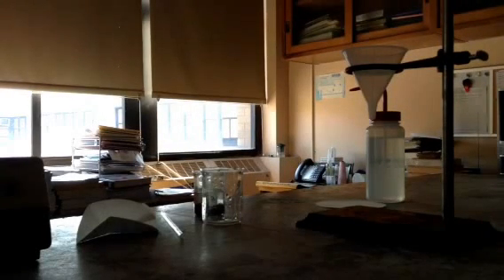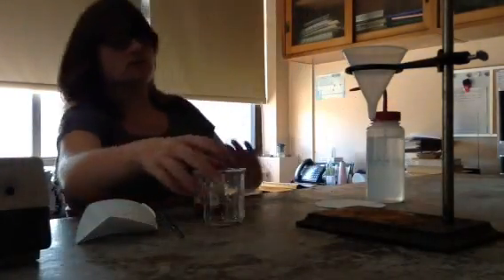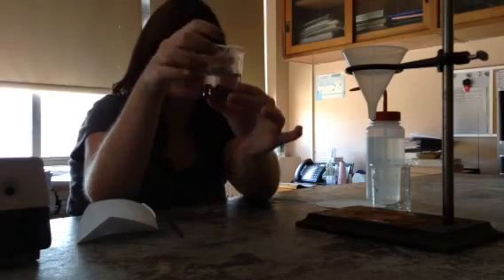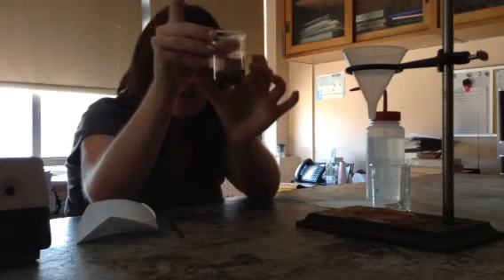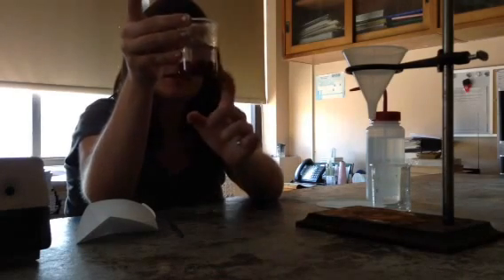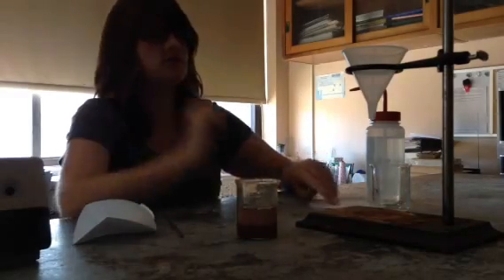Okay guys, so I want to go over the filtration part of our experiment for Thursday. My reaction has gone to completion. My blue solution is now clear with some orange-red chunks in it. Now I want to get these chunks out, but I don't want to reach my hand in there, so I'm going to do something called filtration.